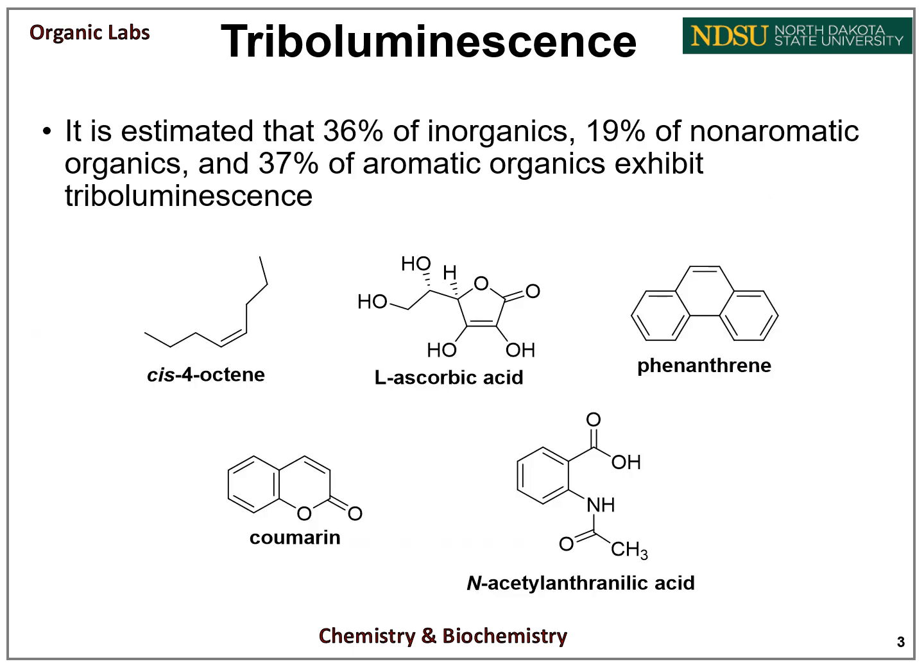It is estimated that 36% of inorganics, 19% of non-aromatic organics, and 37% of aromatic organics exhibit triboluminescence. Some examples are cis-4-octene, L-ascorbic acid, phenanthrene, coumarin, and the compound we will be synthesizing today, N-acetylanthranilic acid.